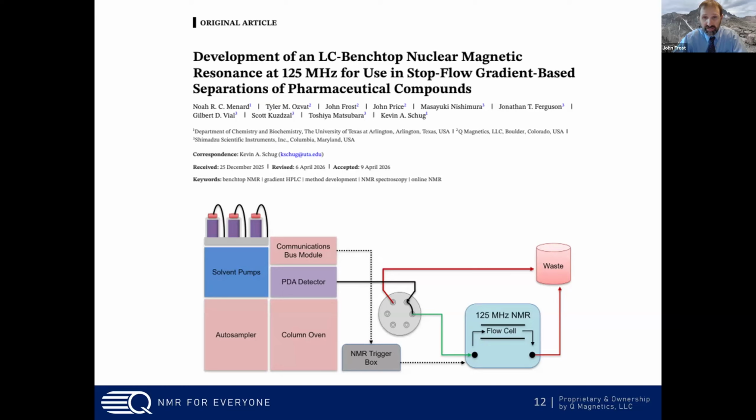Instead, we're trying to expand that application space and the different ways that the actual instrument is utilized, not just as a standalone piece of analytical equipment, but as part of an analytical system, whether it be an HPLC NMR or NMR mass spec, or even part of an automated reaction synthesis system. So where they're running either a flow-based synthesis process or some other analytical automated lab and integrating it into that.